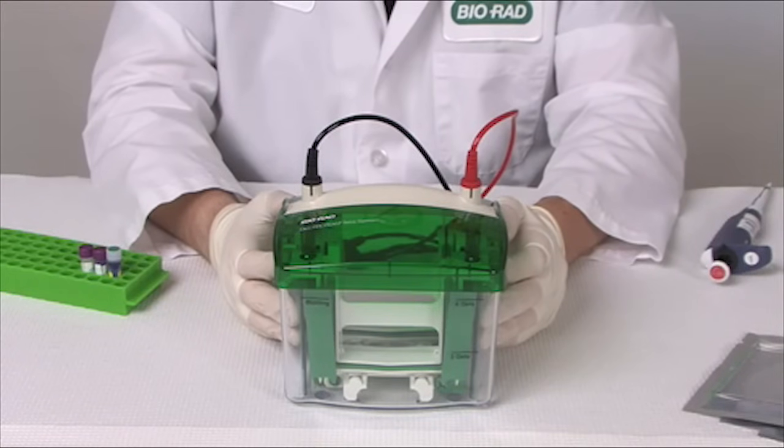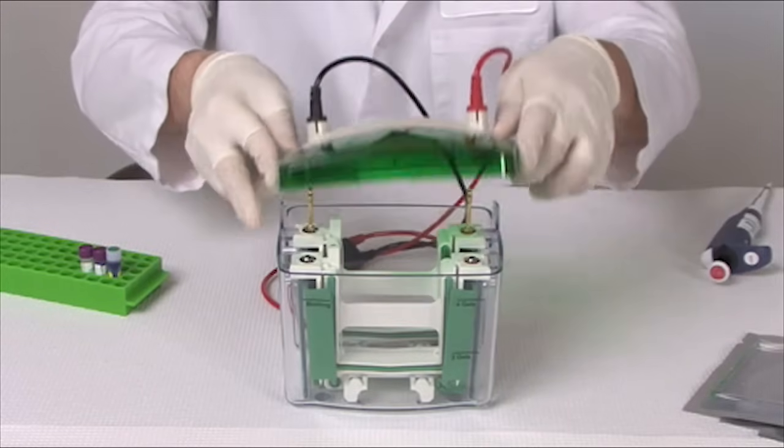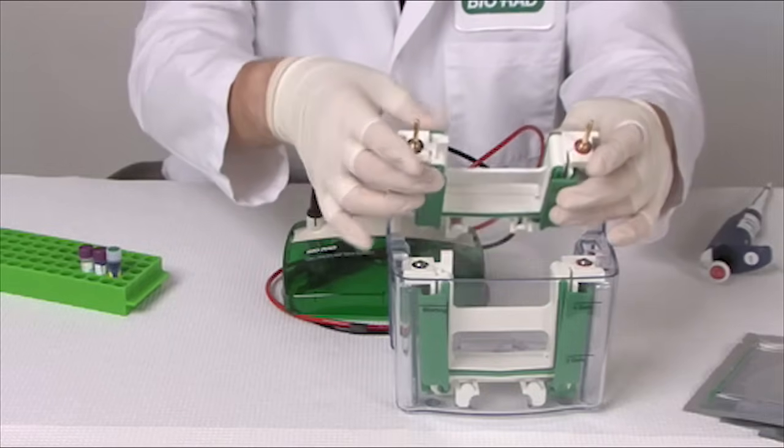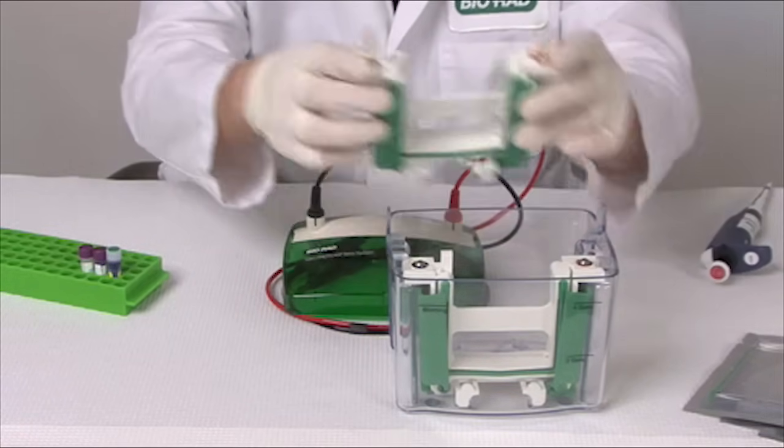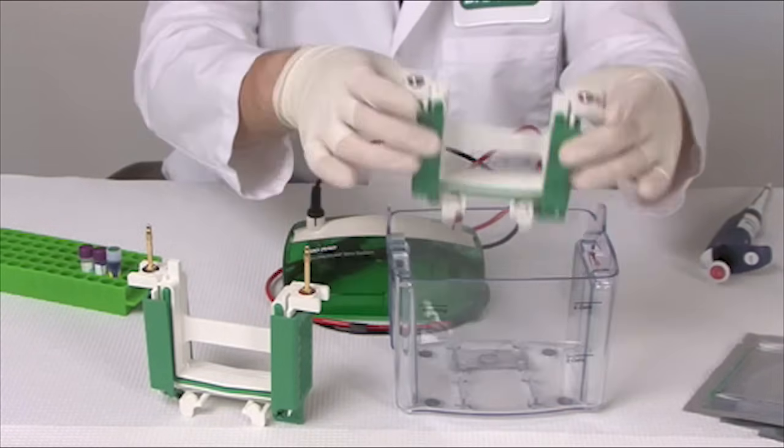You may already be familiar with the MiniProtein TetraCell which allows you to run between one and four gels using two cores. The first core is the electrode assembly module which has two electrode posts. The second core for running three or four gels is the companion module.